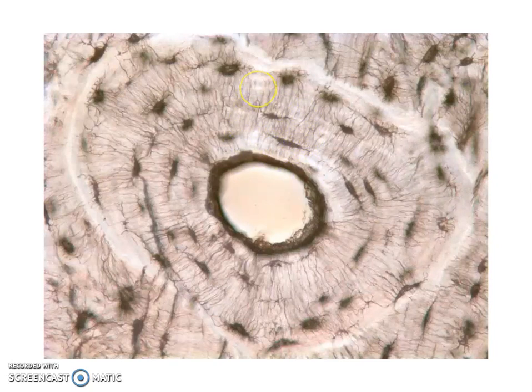That space again is called lacuna, and between the lacuna and the central canal, we've got these little canals which are called canaliculi, plural, canaliculus, singular.